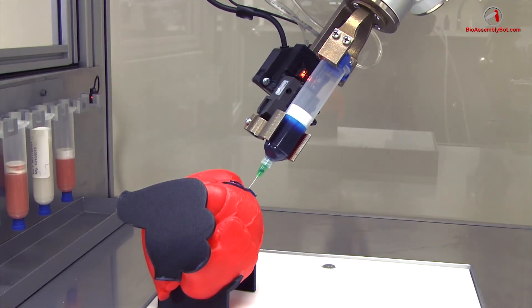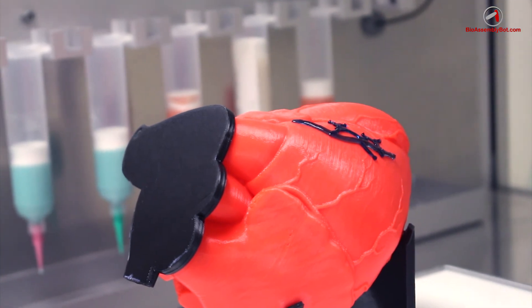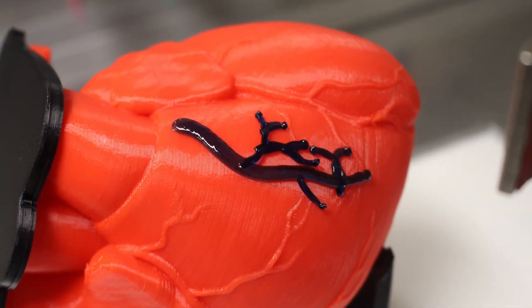Once constructed, this design now can help lead in experiments involving vasculature and tissue construction.